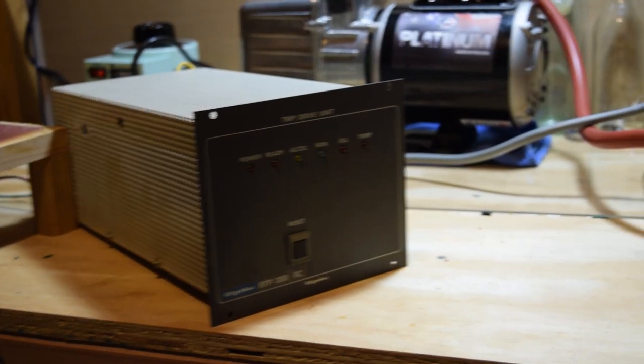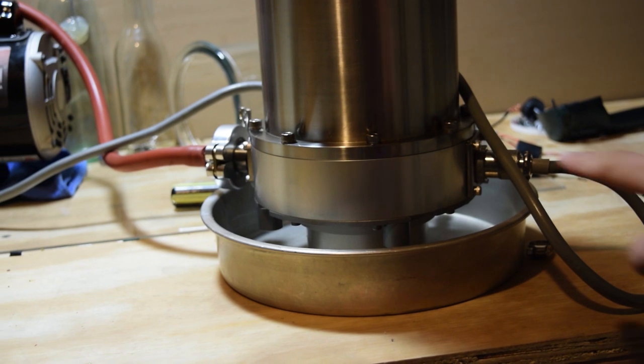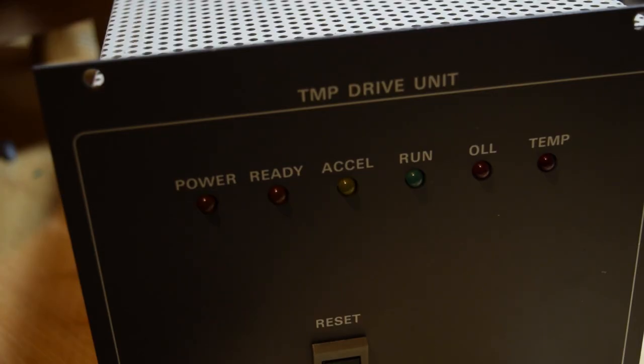This is the turbo molecular pump drive unit, and it connects to the other side of the pump right there. It's switched on with this power switch on the back. When it's switched on you can see the power and ready lights come on, which means that the pump is ready to go.